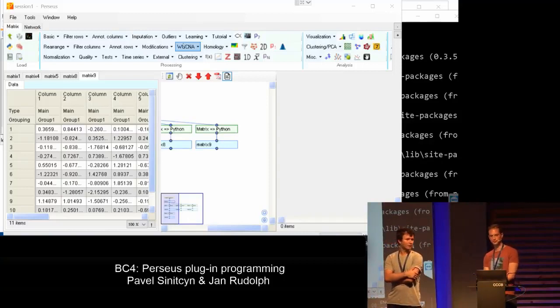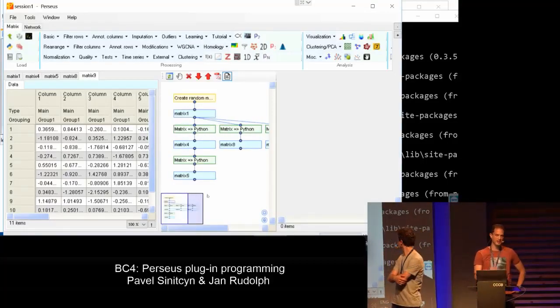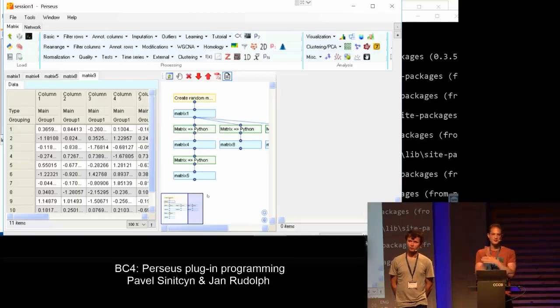One more question. This way you could also more or less streamline an analysis, right? If you have a complete pipeline in Python that reads in a table, then working in a core facility, you could write a whole script for the biologists. They could just select the table, run it and get the output table, right? So you have an automated pipeline. If you already wrote the entire pipeline in Python, you have to remember that you have one input file and you only get one output file. But if that's fine for you, that's no problem. You have to know though that if you use external Python libraries, you have to tell your users how to install Python and all these libraries. But other than that, it's really all up to you.